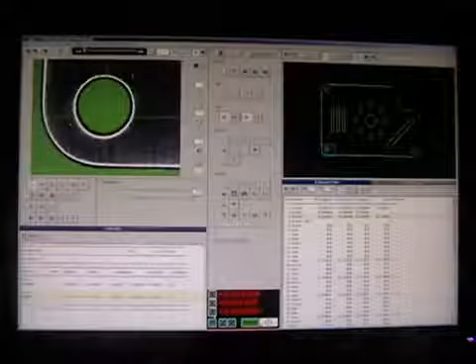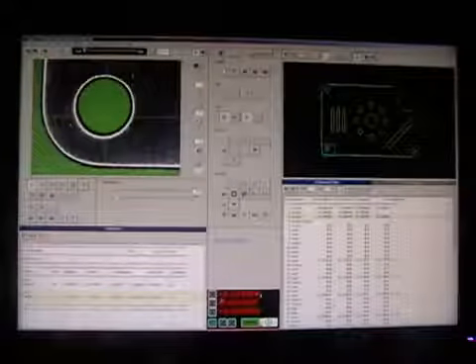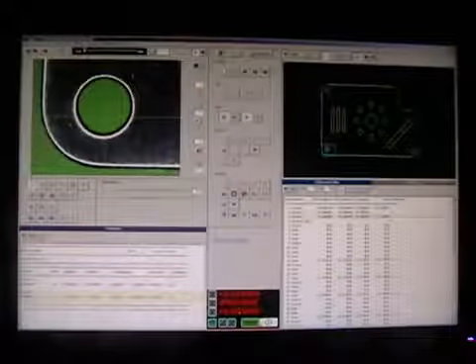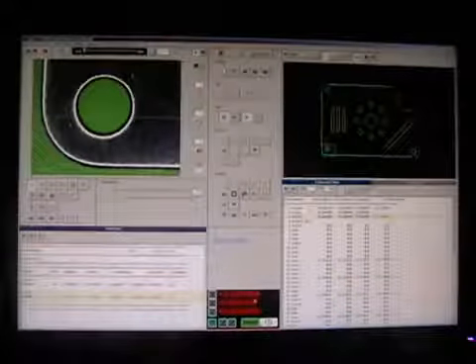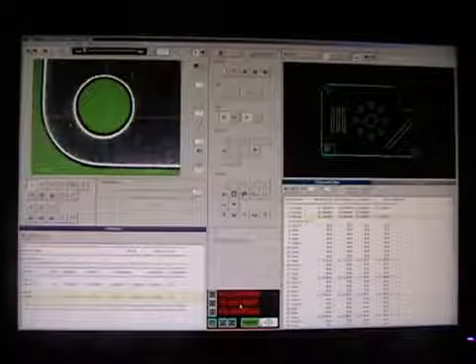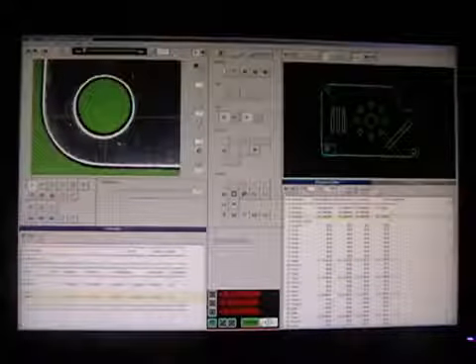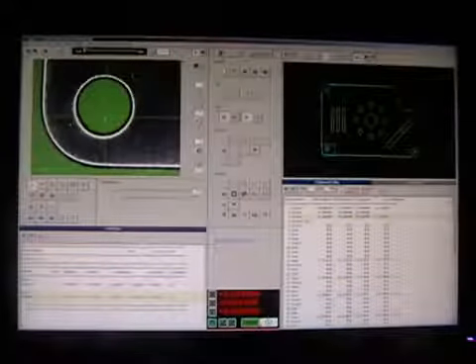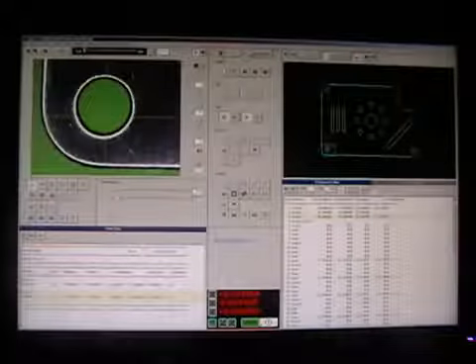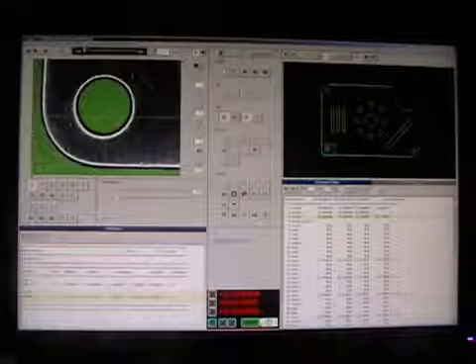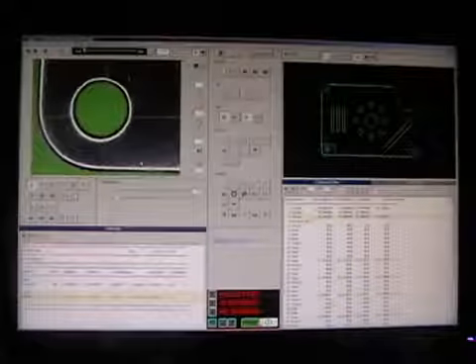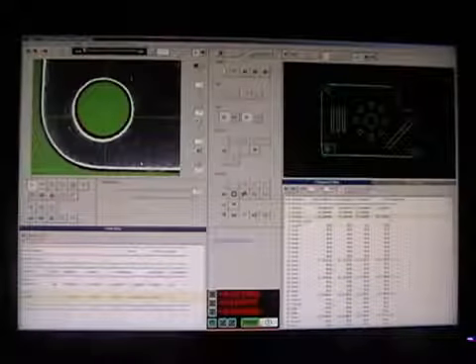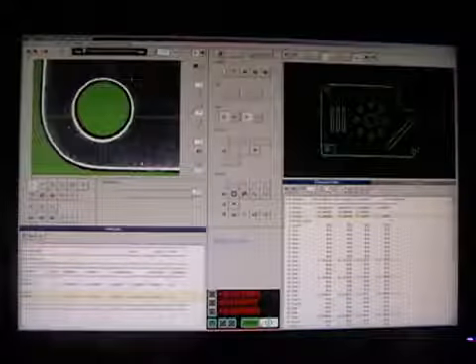To the right of that is where we see the digital readout. Now the digital readout here shows X, Y and Z and it always reports the current location of the centerline of the optics which in this case is seen here as the centerline of the crosshair. As we move the stage, you will see how that counts and in this way these systems behave just as it would with the standard measurement toolmakers microscope or an optical comparator.